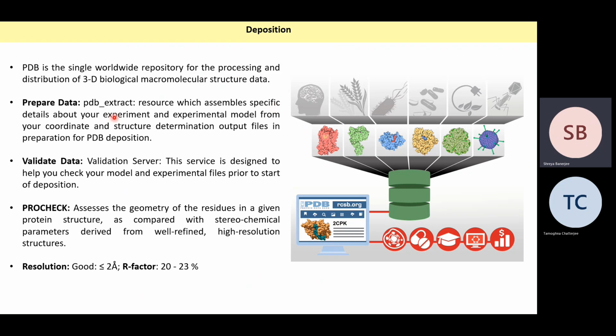So for deposition, the first step is to prepare the data using a resource called PDB extract. That resource assembles specific details about your experiment and experimental model from the coordinate and structure determination output files to prepare for the PDB deposition.